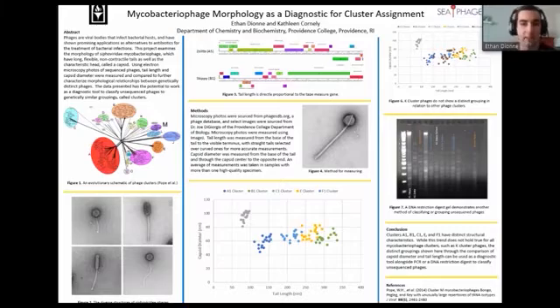So you might ask, why, what use is this data to us? Well, it's very useful alongside different types of data. So in figure 7, I have a DNA restriction digest gel.